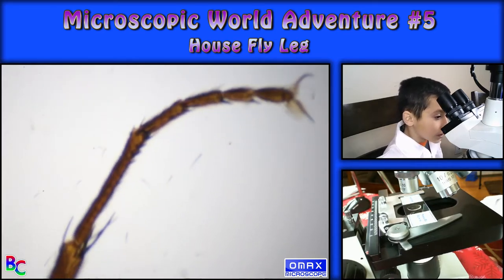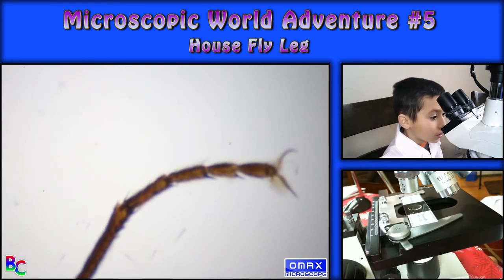I think because it's like long and has a head — I'm going to zoom up on that.